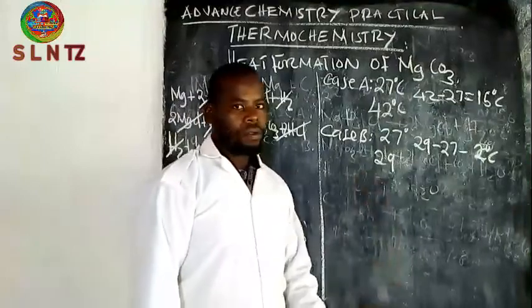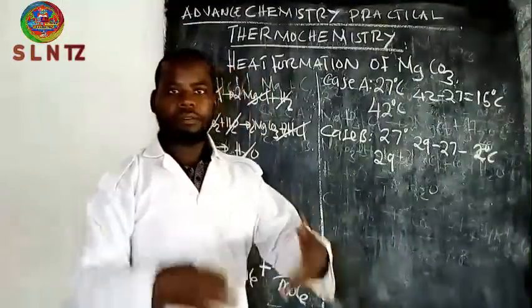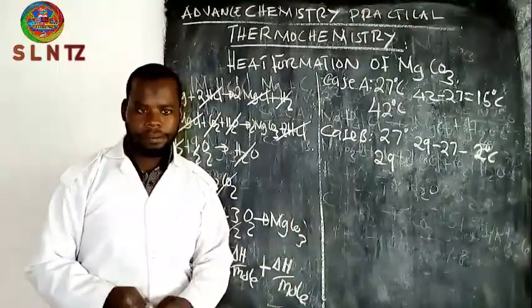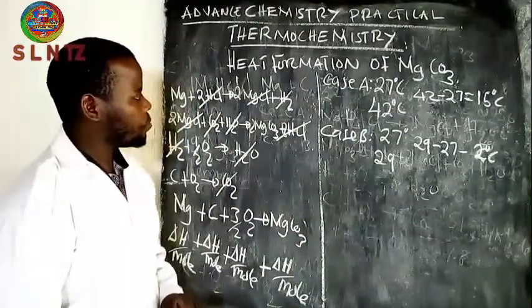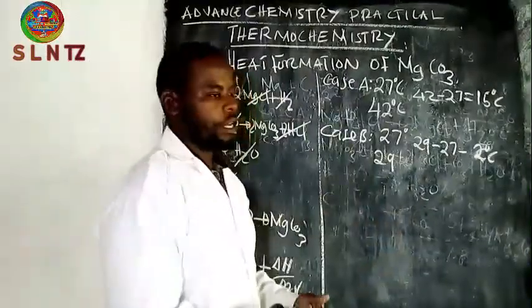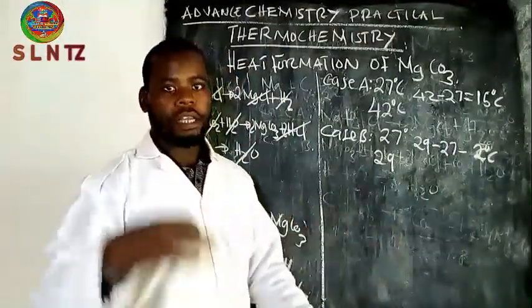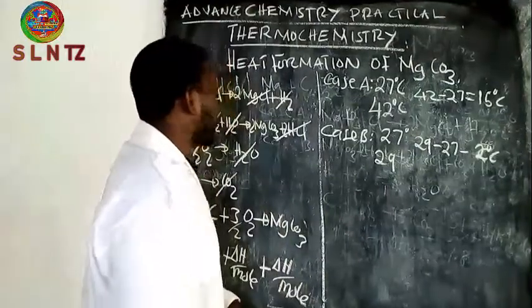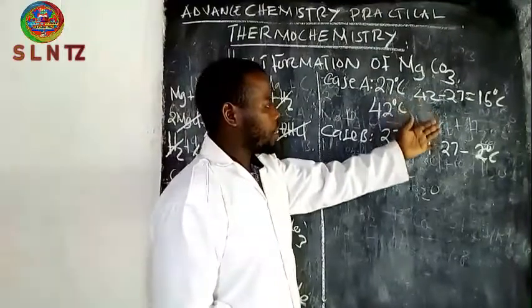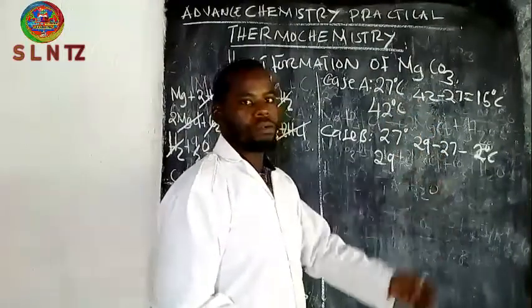That is how you can perform the experiment. It's very simple, it's very short. I think you have seen, you have understood. So now we are going to proceed with calculating the molar heat change. Just make sure you note this one, and then we go to calculations.